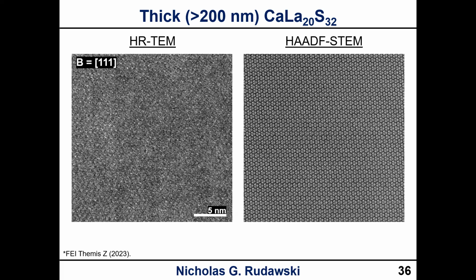Oh, that's very interesting. So one of the things I would recommend, of course, is imaging. In this presentation, I only talked about imaging, but imaging often doesn't tell you the whole story. I talked about this in my webinar back in May on essential techniques, and I talked about STEM EDS mapping, and about that being essential to provide information beyond what you can get just from imaging.